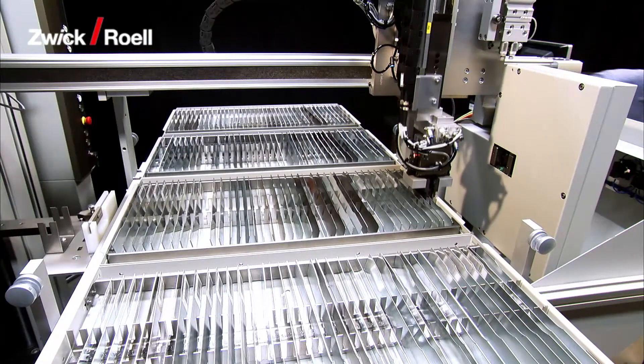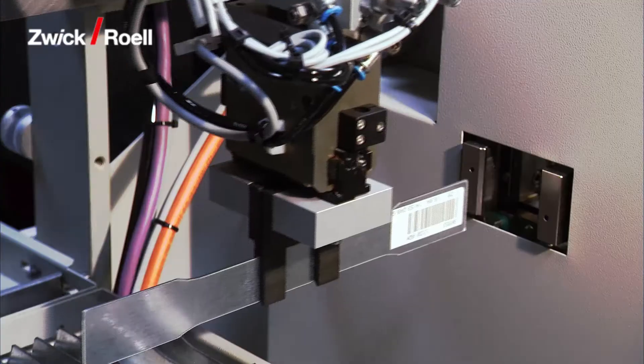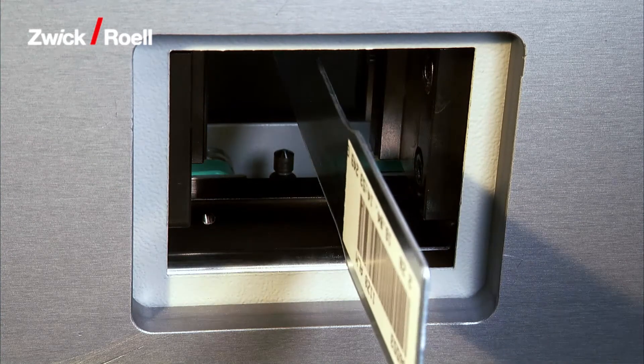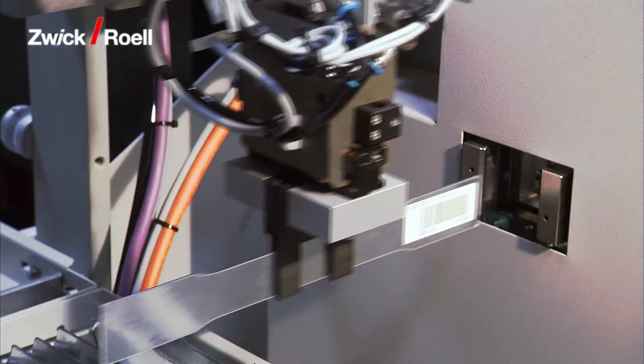The robot removes the first specimen from the magazine. The specimen then passes to the cross-section measuring unit. Four measuring transducers are used to determine thickness and width at one or three points along the parallel length of the specimen.